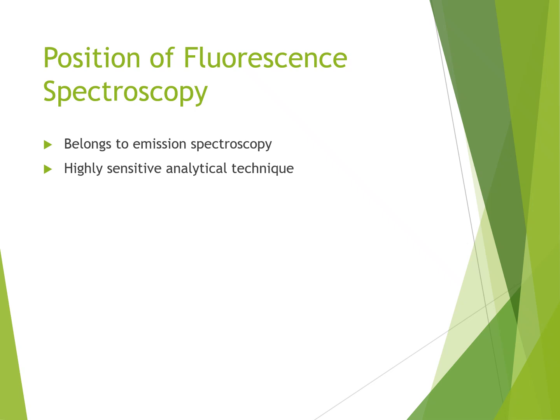Fluorescence spectroscopy is a type of emission spectroscopy. Instead of measuring absorbed light, we measure the emitted light, which is produced by fluorescence, and this allows detection of extremely small concentrations.